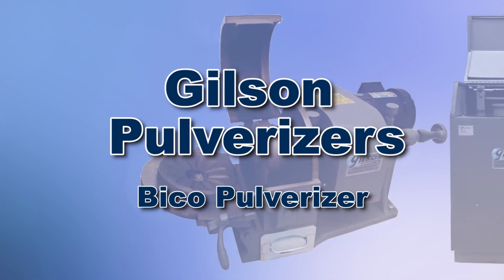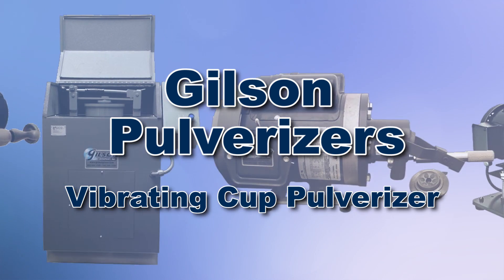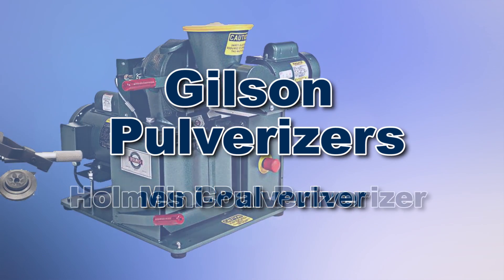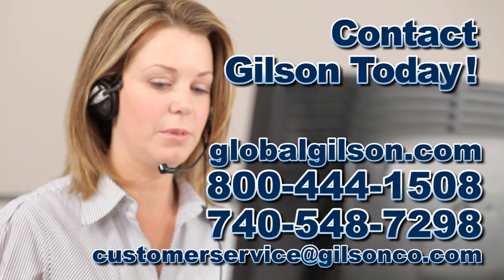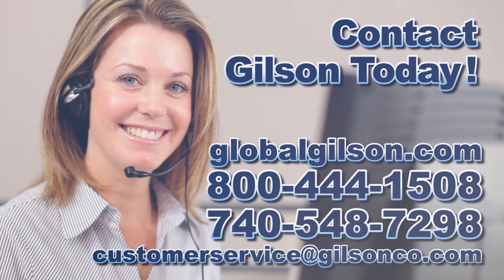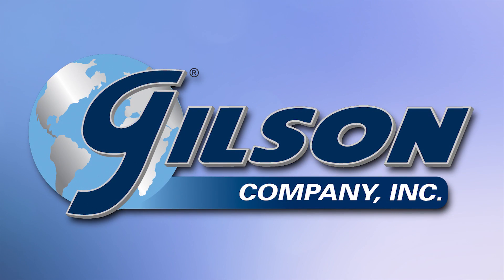With Gilson's complete family of pulverizers offering a wide range of performance features and capacities, Gilson has the right equipment for your fast, accurate, and reliable material processing. Be sure to check out all our products listed in the Gilson catalog and on the Gilson website. Gilson — your industry leader in material testing equipment.